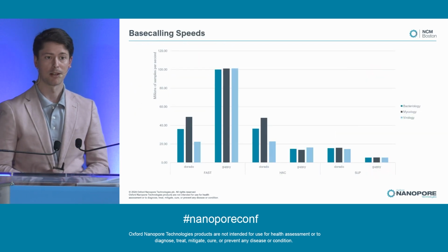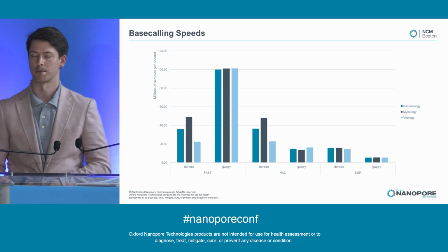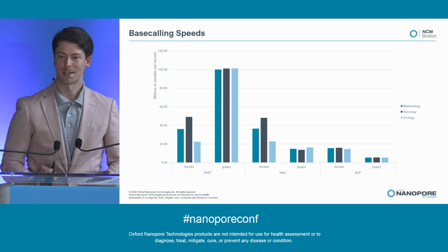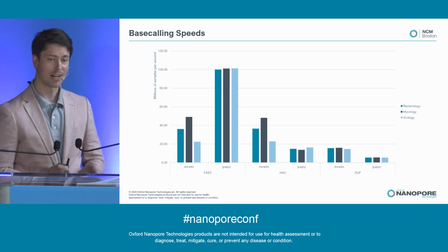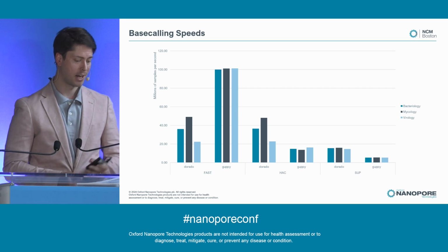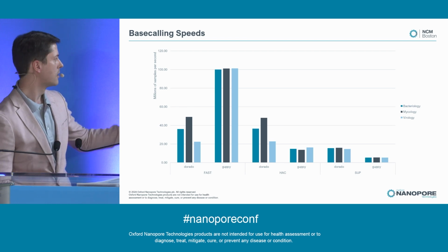Plenty of people have spoken about the quality scores and how they may change from the fast accuracies through the superior accuracy mode, the read lengths and all of that. I'm not going to talk about that because they're correct. We've seen it. The superior accuracy mode is indeed more accurate, but instead I just want to talk about speed. Simple, straightforward, and to begin with, I want to focus on what I think is probably the weirdest thing that I see on this chart.